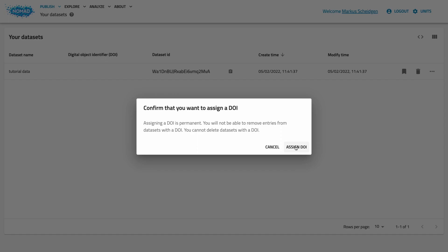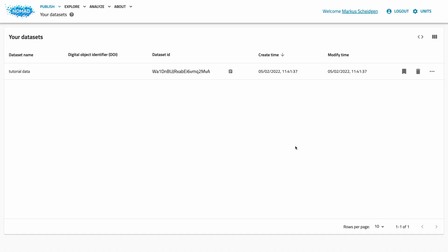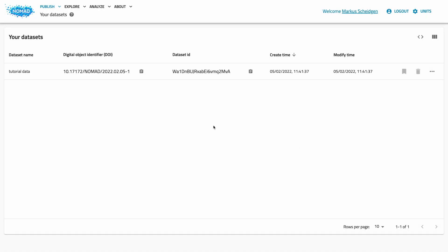Let's create a DOI for our example dataset. Be aware that the DOIs in the test installation are not registered and won't really work. The real DOIs from the official NOMAD installation will resolve to the dataset page of the respective dataset. From there, your readers can explore all entries, download the raw files and processed data. This concludes this tutorial. You saw how to upload and publish data with NOMAD. Thank you for following this tutorial. You will find example data and links to NOMAD in the video description. See you in another video.